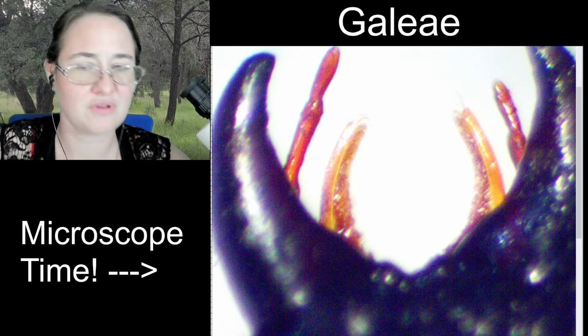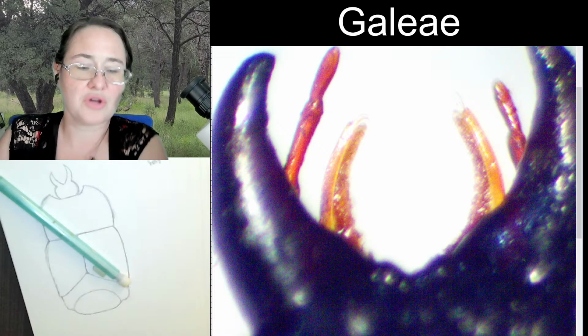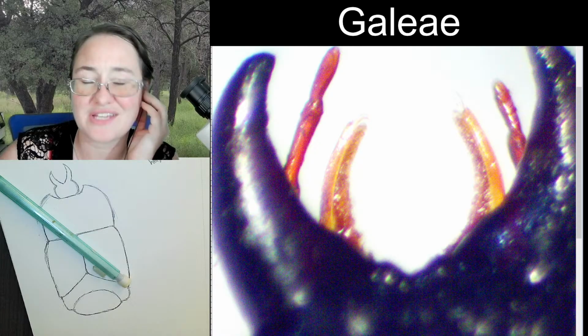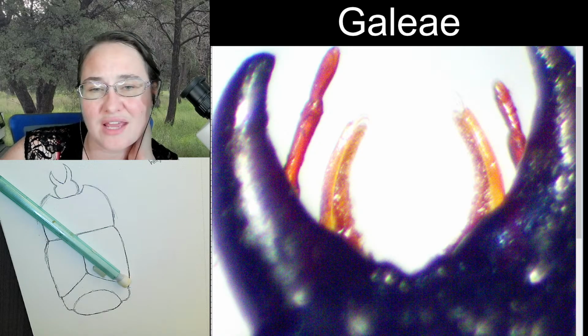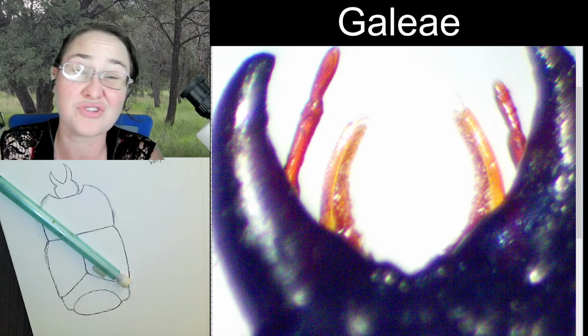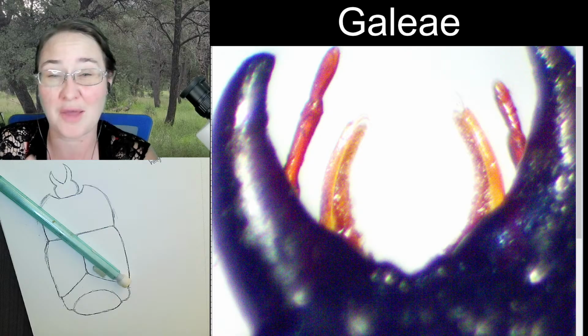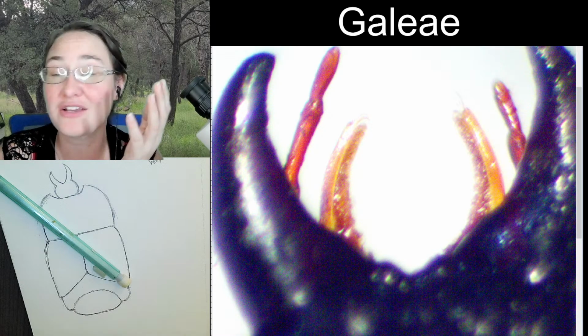So that's what those are. They're essentially the tongue of the clown beetle. And they've got a stem along the outside, and then there are these very fine hairs along the inside. And those hairs are likely going to be uptake hairs, so they're going to be able to pick up any juices that the bug leaks while they're eating it and slurp them up through those hairs.